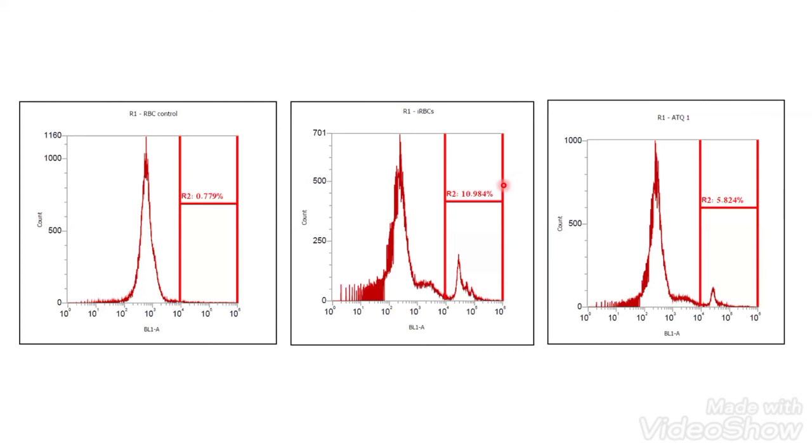Generally, nowadays people are utilizing flow cytometry for bacterial population analysis, and they are going up to 7 to 8 populations. They are also testing sputum samples for the presence of Mycobacterium tuberculosis and E. coli, so there they are testing 3 to 4 bacteria, and we can test the bacteria you are looking for.